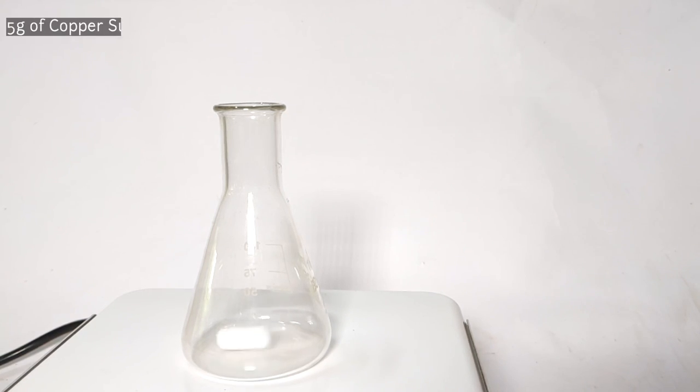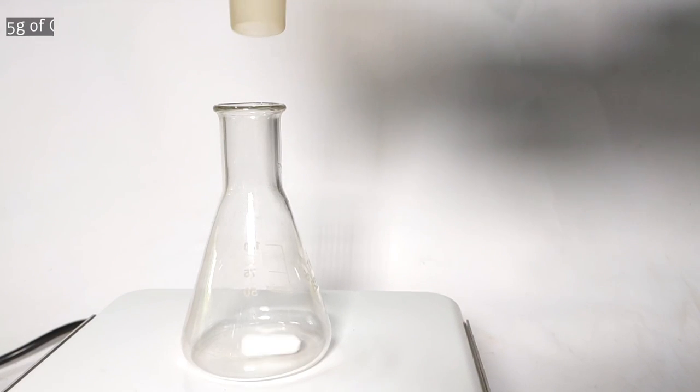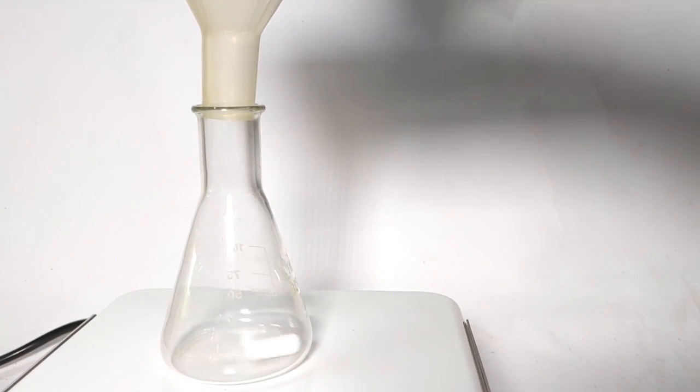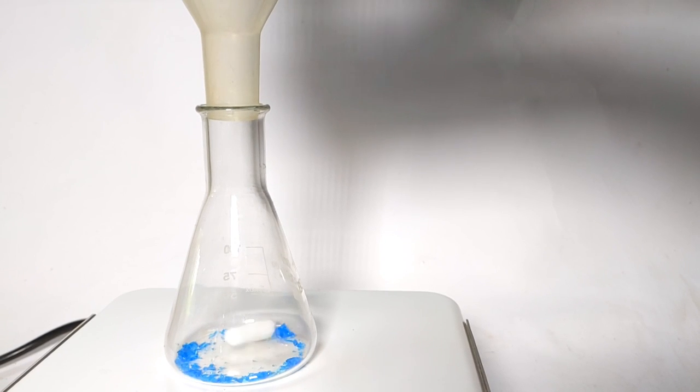Start by transferring 5 grams of copper 2 sulfate pentahydrate to the 100 milliliter conical flask kept on a magnetic stirrer with a stirring bar inside. I use this funnel as I always spill the solid chemicals while transferring them.